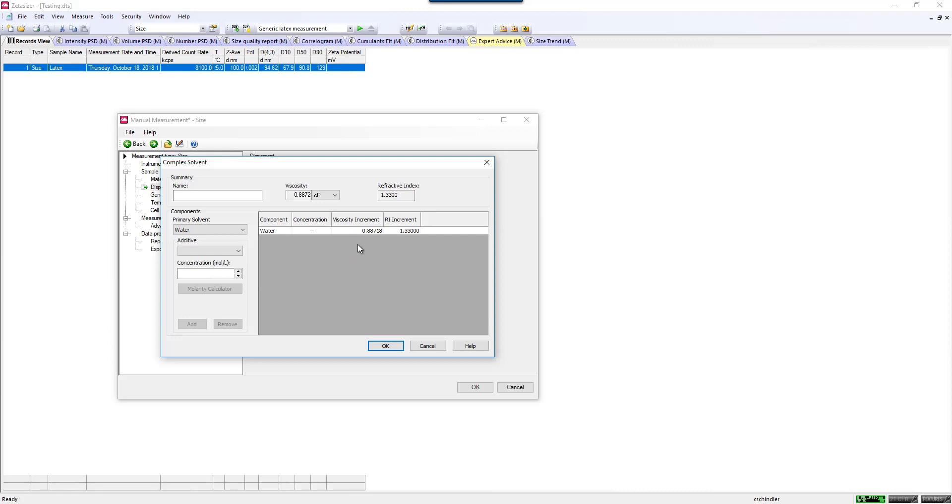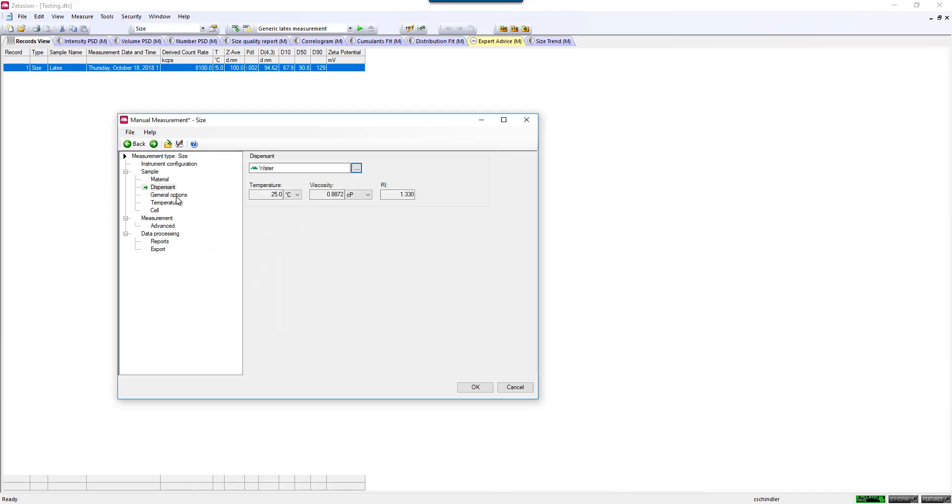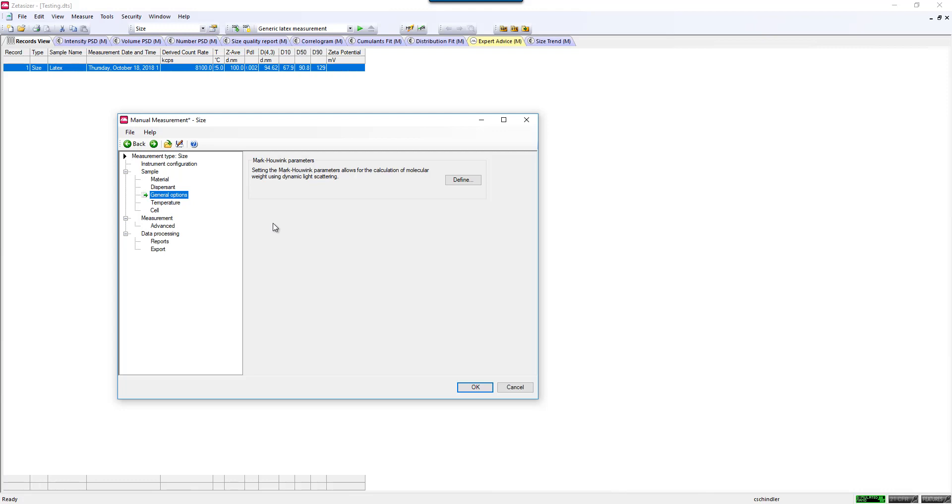Our calculator will increment the refractive index and viscosity for you. The next tab would be the Mark Houwink parameters. This is something that is not critical for the measurement. This would be for calculating a molecular weight or estimating molecular weight using the dynamic light scattering hydrodynamic result.